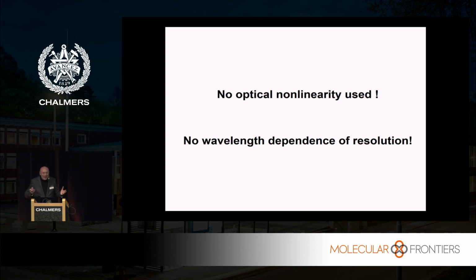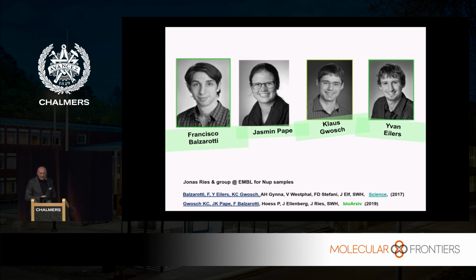Because what you do is match two singularities: one is the molecule, and the other one is the zero. And in first approximation, the wavelength, as I indicated with the thought experiment with this little demon, doesn't really matter. And there's also something very heretic, if you think about it: no wavelength dependence in a focusing light microscope's resolution. I mean, this is crazy. Anyway, it shows science is crazy at times.